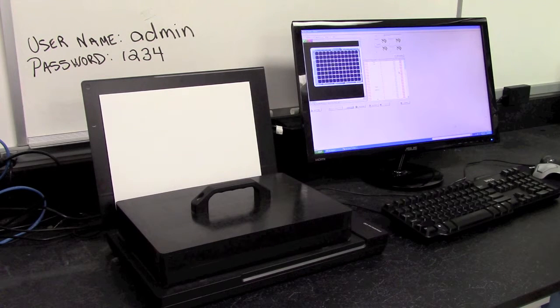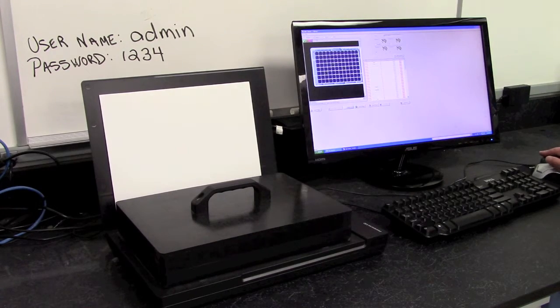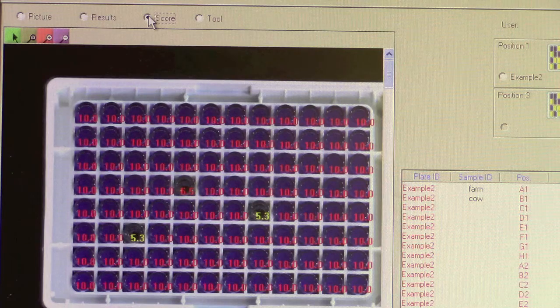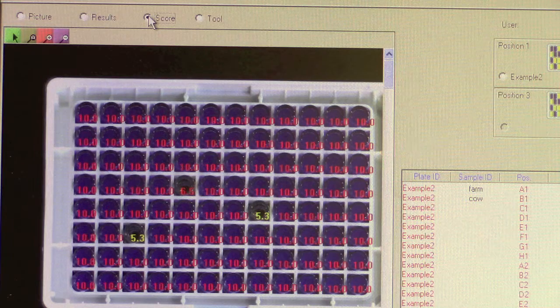So you can see for this plate, all of our samples, all the dark blue or purples are positive. But if we scroll through, there should be a few samples that tested negative if we identify those properly. At the top, we have an option to say results. We can put the score, so we can superimpose the number that was identified for each sample above the well. So here in one of these yellow wells, we had a 6.5, and we can find that here on the screen, where 6.5 was right at the threshold level of our test, so that was still determined as positive.